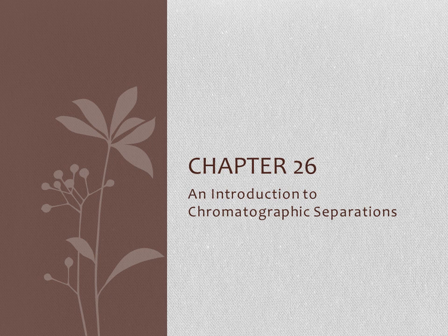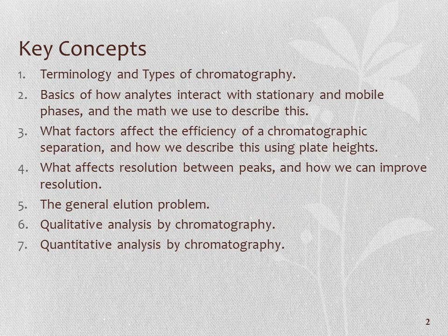Hi, this is going to be the introduction to chromatographic separations. In this video or screencast, I'm going to try to emphasize some of the basic terminology of chromatography and the fundamental principles about how an analyte or molecule interacts with stationary and mobile phases, how this causes separation, and some of the key fundamental math that we use to describe this. I'll try not to focus on every step of the math, but on some of the most important things.